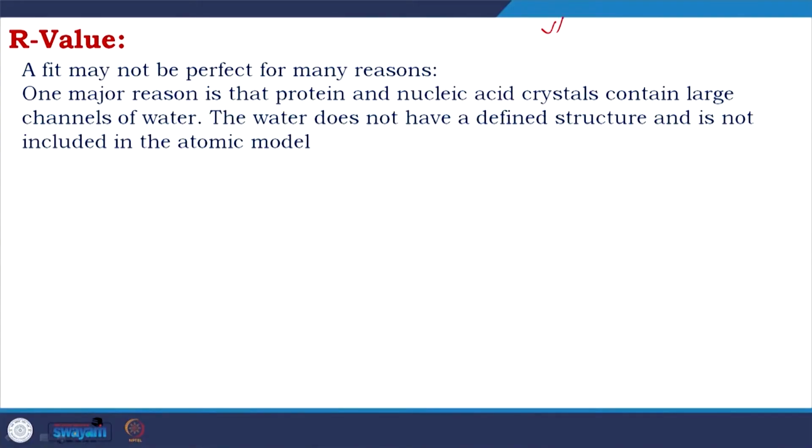If it is an enzyme, it is difficult, because if you add A plus B to get C plus D, in the mixture there will be A, B, C and D. I will explain a little bit. Remember I told you that in crystallography, crystallization is a very critical part, we all discussed that. Now, to get a crystal, one of the major challenges in the crystallization process is that it should be homogeneous.